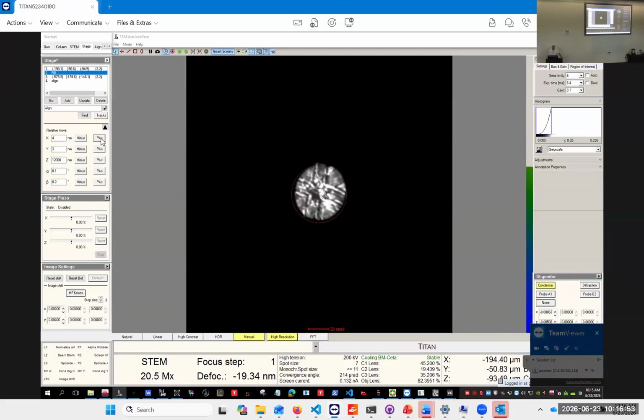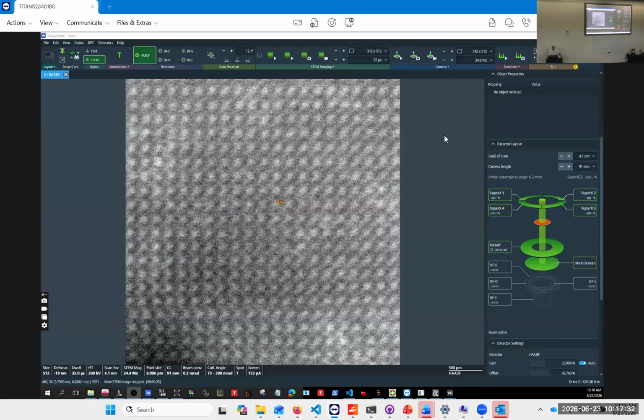Okay, a bit brighter maybe, so that you see that. And I will do some things that we shouldn't normally be doing. So this is our center. It's silicon 110, so it's kind of square. Let's move to a different position. I want the thicker one so you see that better.